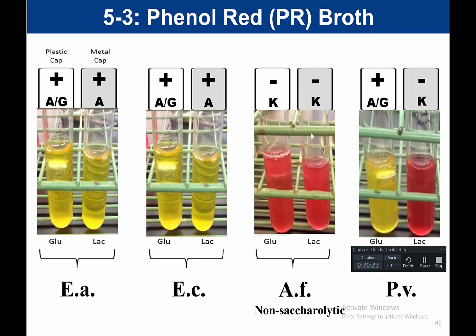You do not need to memorize the results of this experiment. I will not ask you what was E. coli's reaction or what was Proteus vulgaris's reaction. That I don't care about. What I do want you to take away from this, though, is that if you were shown a tube like this, you should be able to tell me what that tells you, meaning what is your interpretation.